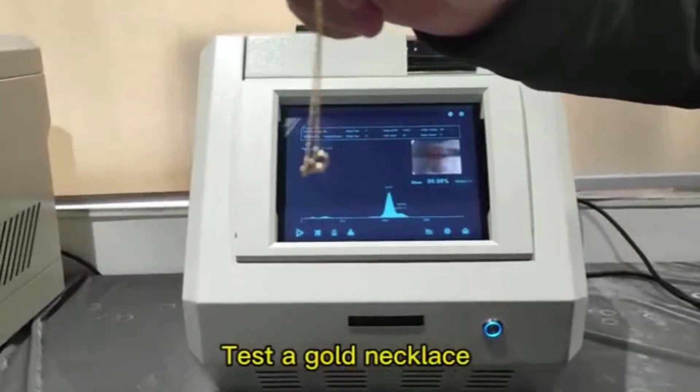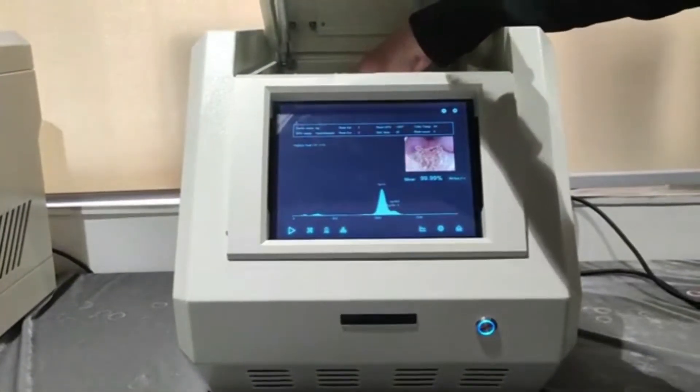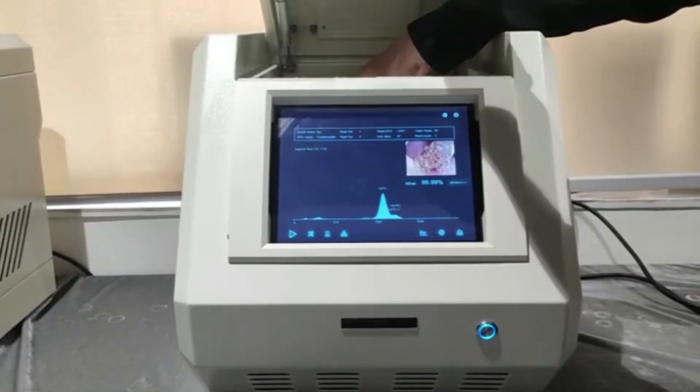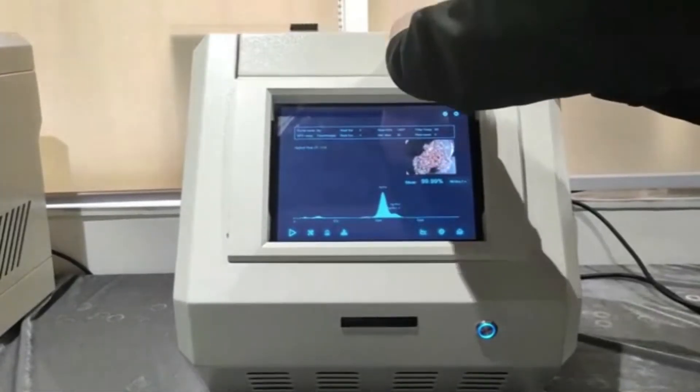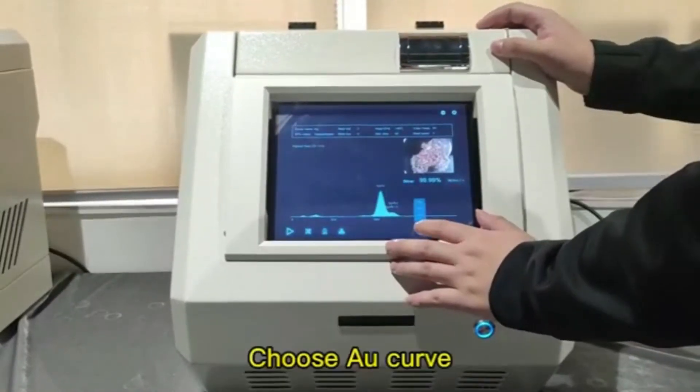Test the gold necklace. Choose Au curve.